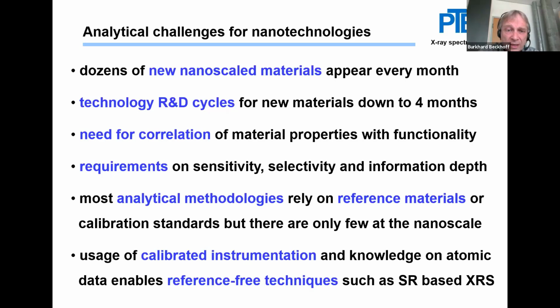So for most analytical methodologies, one has to rely here on reference materials or calibration standards, but there are only few at the nanoscale. And this is one of the interesting points for TXRF. You cannot get a well-defined and stable contamination layer of a thickness of 0.1 nanometer.